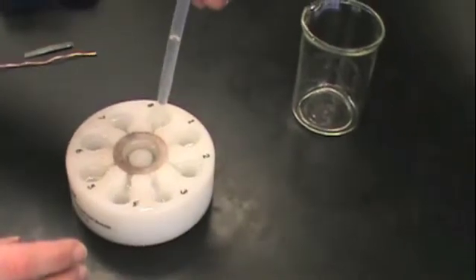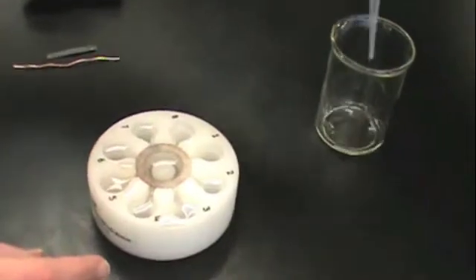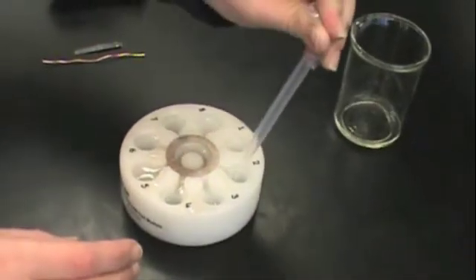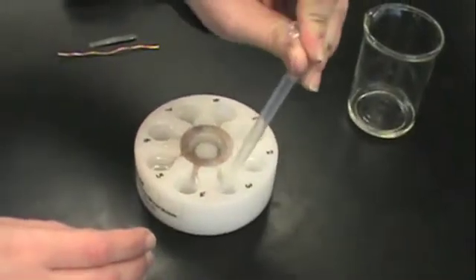Use a dropper to remove all the storage solution from the wells, including the central well. We don't want to pour the solution directly into the waste bottle because this is often a very messy process, so take the time to use your dropper to remove the solution from each well.